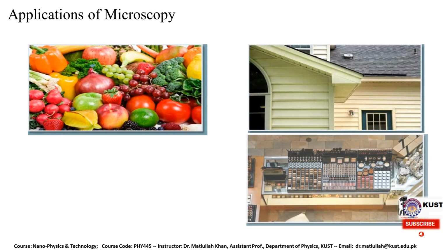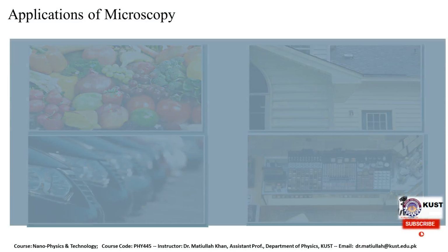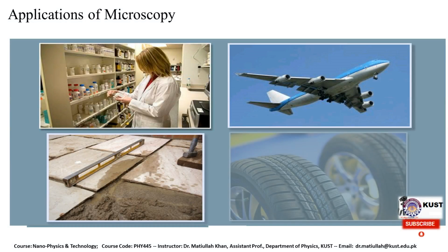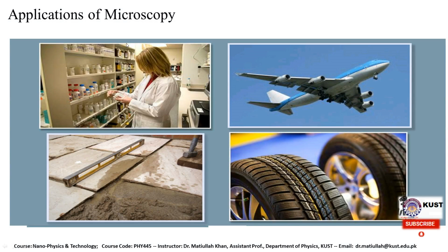The application of the electron microscope is really very vast, because we need it for the investigation of different instruments we use in our daily life. It has a vast spectrum of applications, from aviation to mechanical engineering and medicine, as well as in all cases of research.